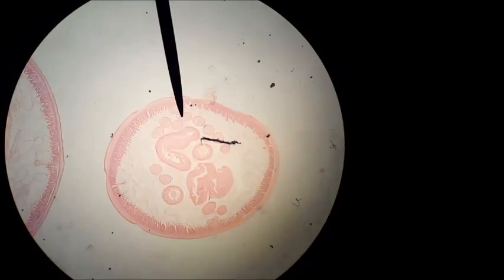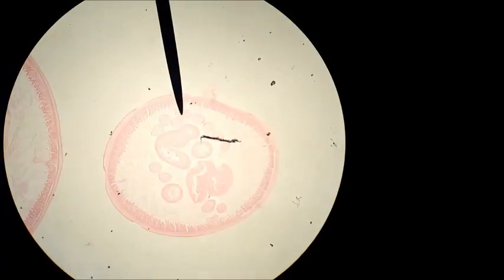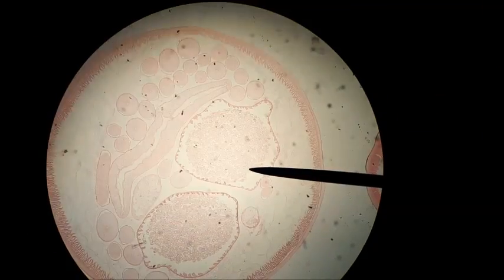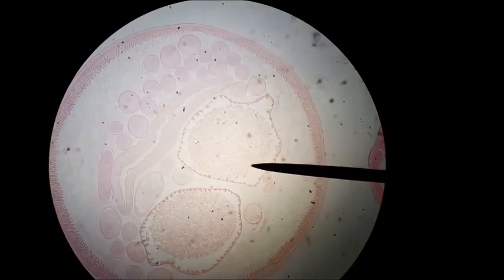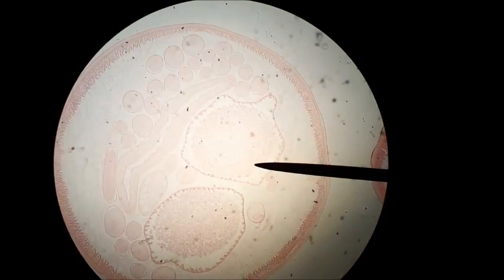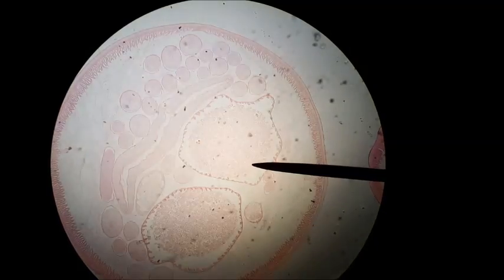To the left is a female, a larger cross-section which I'll go to next. This is a female Ascaris worm and I have the pointer on what I believe to be a vast quantity of eggs.